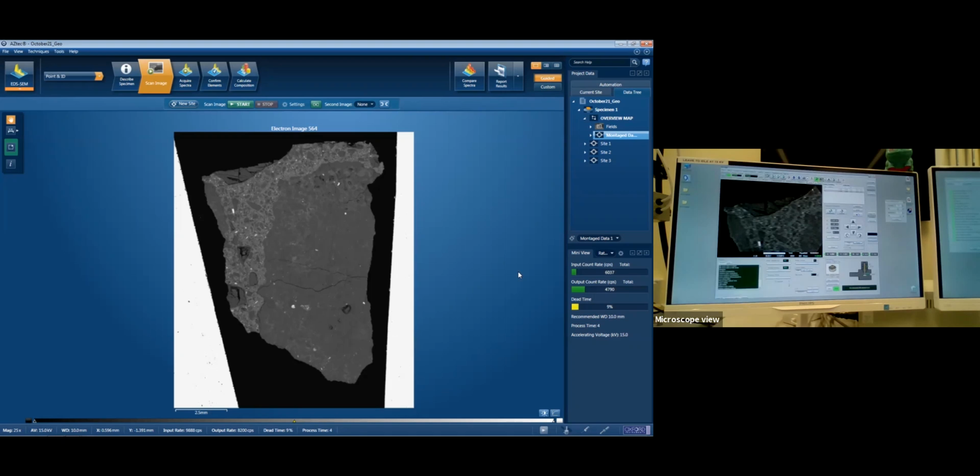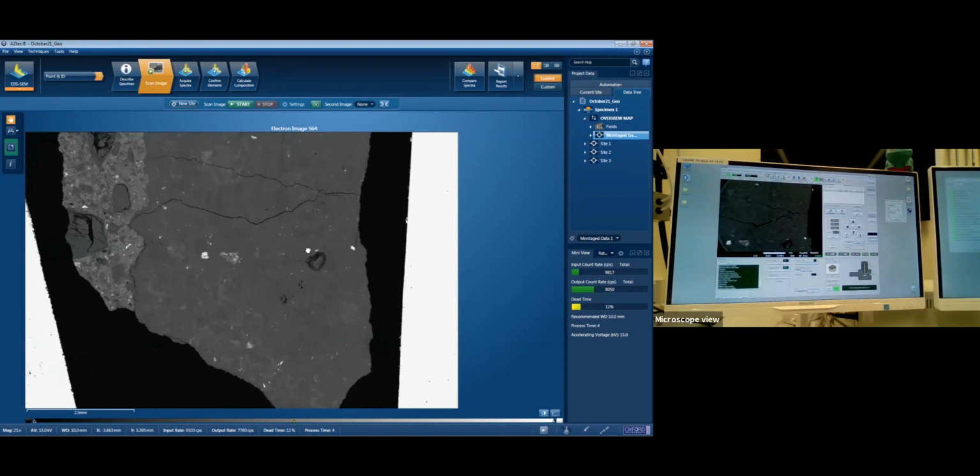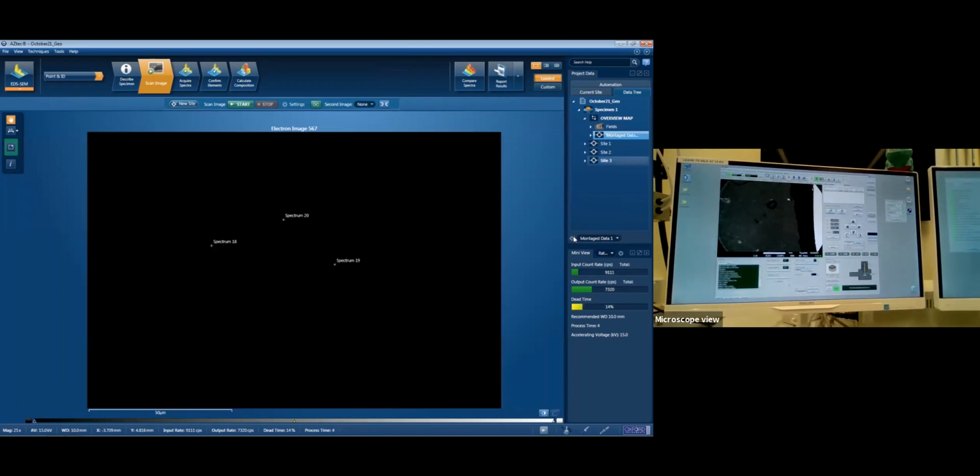So often what we're looking for when we get a random rock like this is any areas that are lots of different shades of grey, or any particular big features in there or some weird textures. Right-hand side, lower right, inclusion on the lower right. Okay, so we'll aim for the circular shape in the bottom right. Right, I will set up a new site.